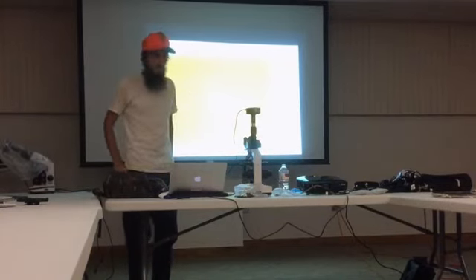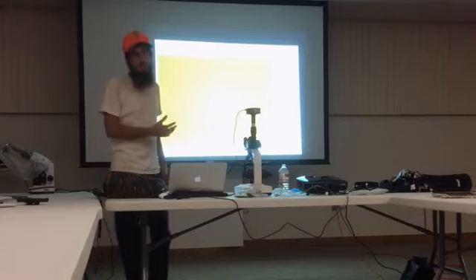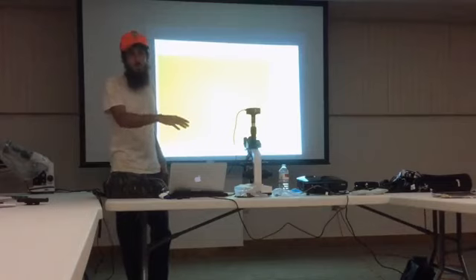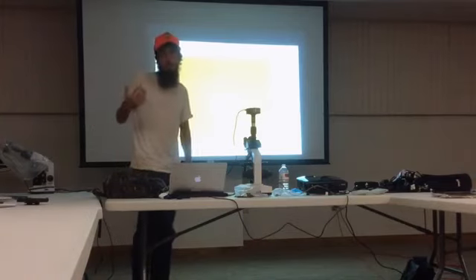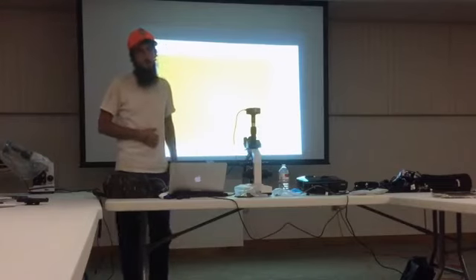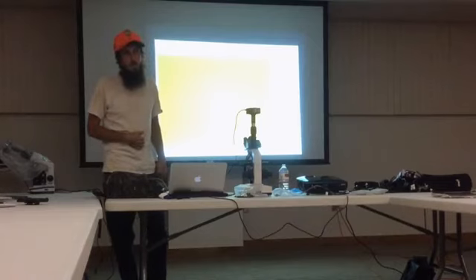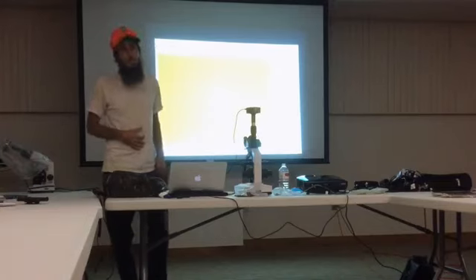So that was one per every view. If you saw one fungus per every view, then you would have equal parts, you think? Okay. Yeah. And also, like you saw, I was cruising around, and I saw predominantly beneficial fungus as well. That's another thing. If I'm seeing predominantly not beneficial fungus, then I know you should make actinobacteria to go in, and they kind of clean the slate for you. When you say one fungus per view, what's your magnification? 400 times. Yep.